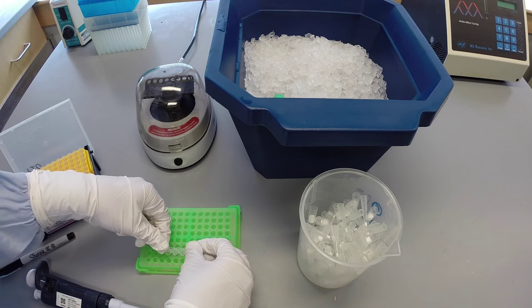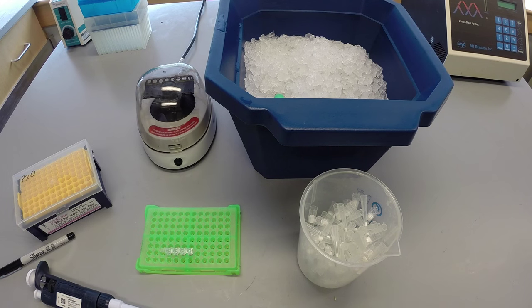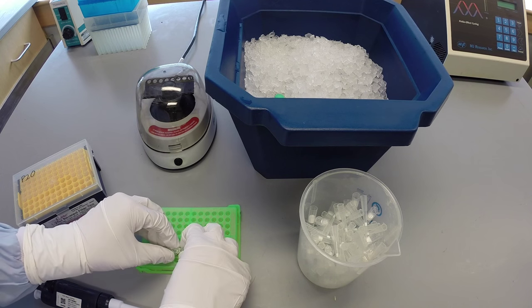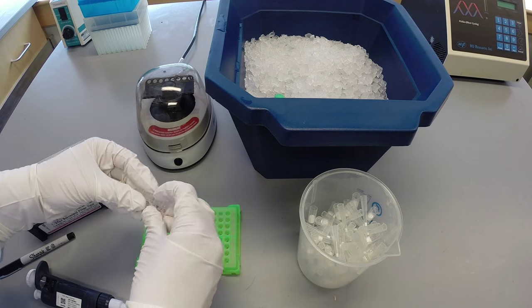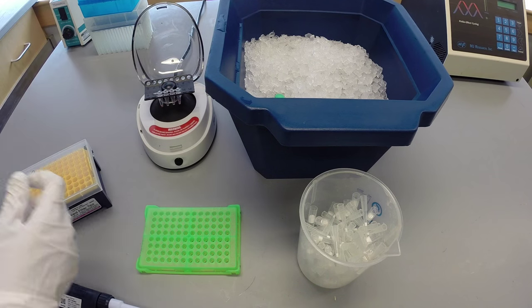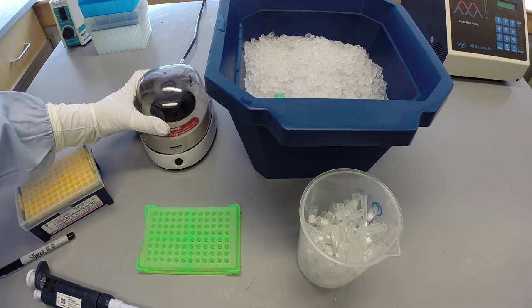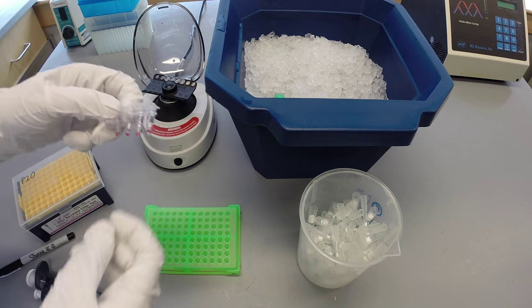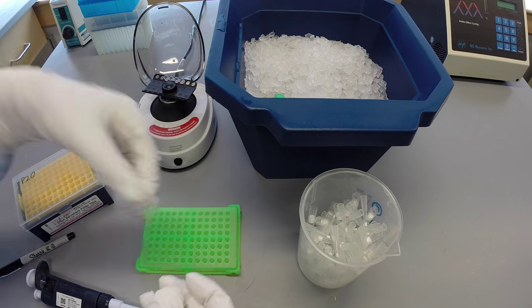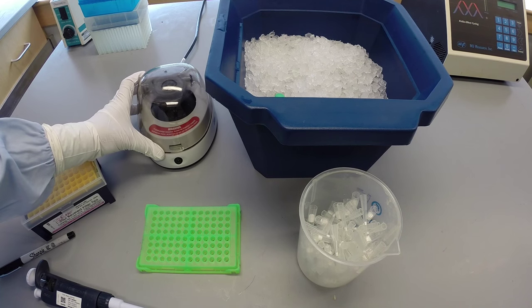Cap the tubes, mix and collect the samples. Because there is very little volume, the solution may have bubbles. You can recentrifuge, but as long as the solution is collected together at the bottom of the tube, it should be fine for the reaction to proceed.